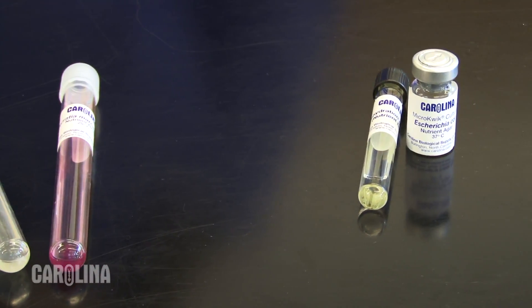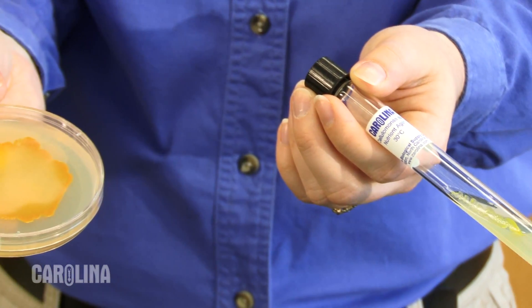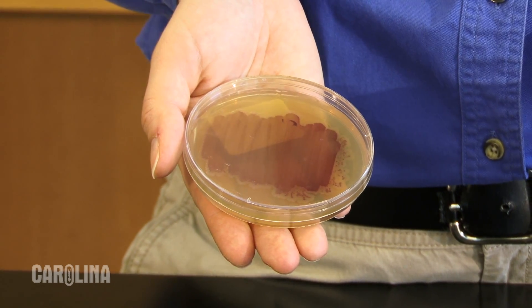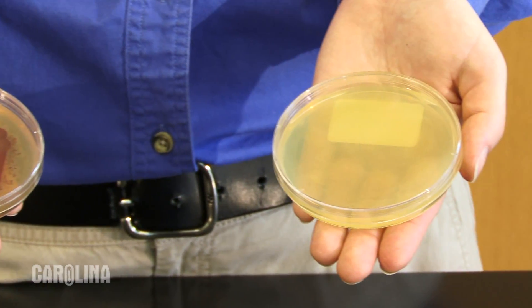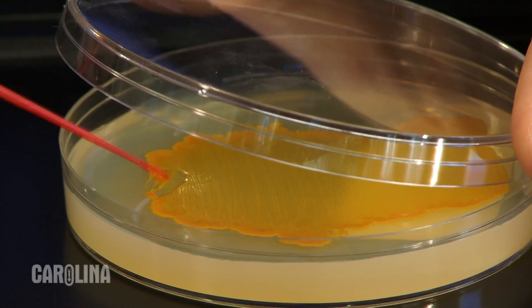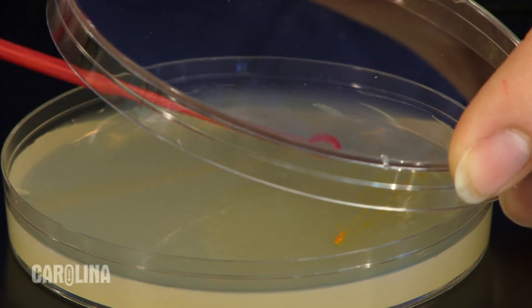We also offer bacteria cultures on agar media, either in petri dishes or in test tubes. On agar media, bacteria grow across the surface. Sometimes the colonies are easily seen because the bacteria produce a color; other times it may appear that there is nothing at all. Use a sterile inoculating loop or swab to remove bacteria from the surface of the agar. Do not melt or heat the agar, as this will kill the bacteria.